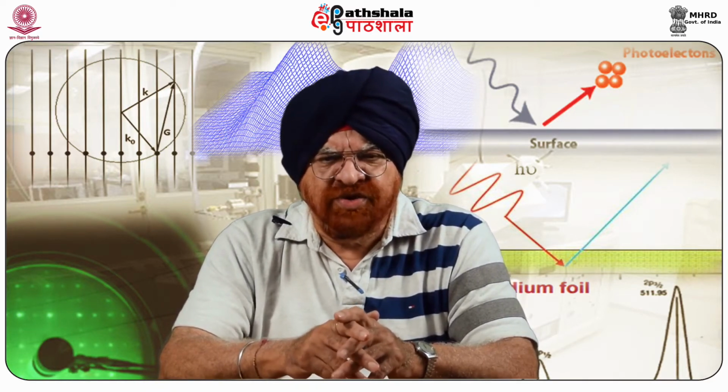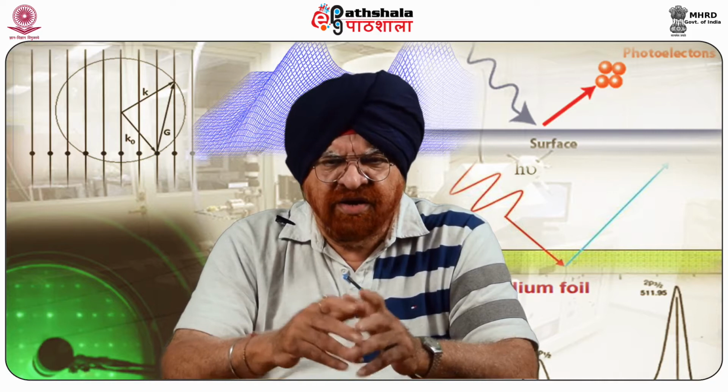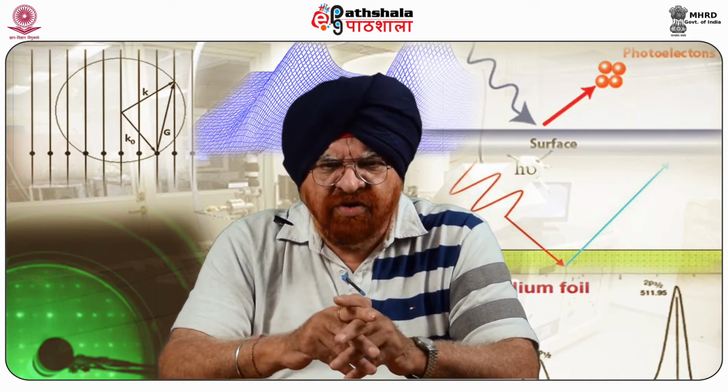Sensitivity also is of a very high order. The concentration which can be checked with this could go as low as 0.1 atomic percent. Surface specificity also is very high, and less than 10 nanometer level can be detected from the surface.